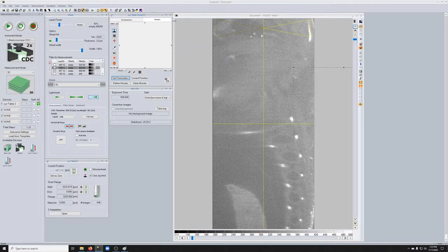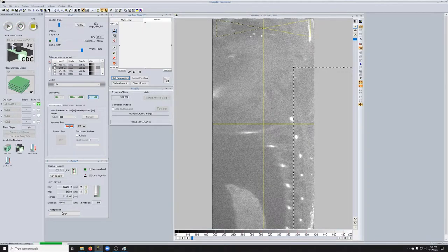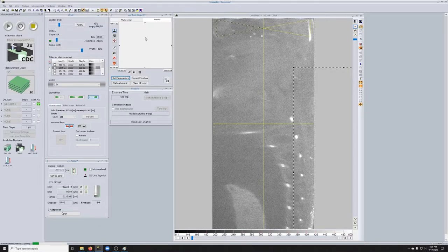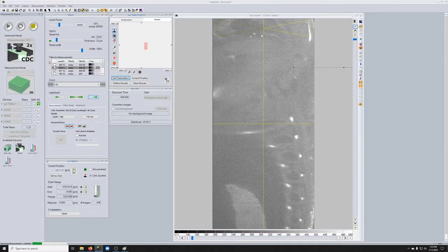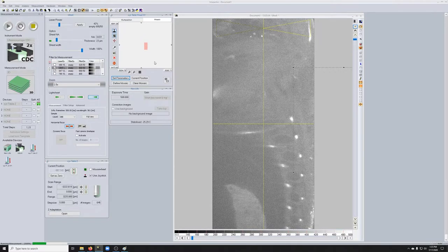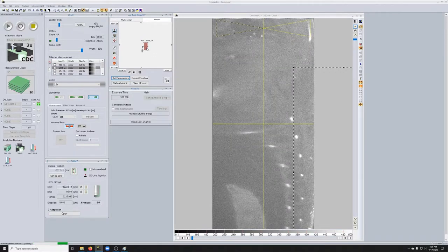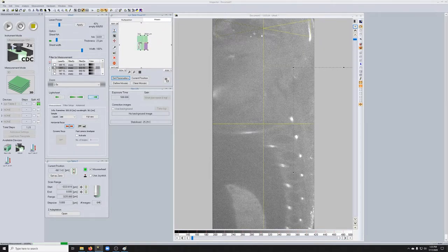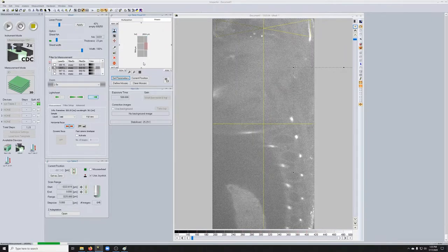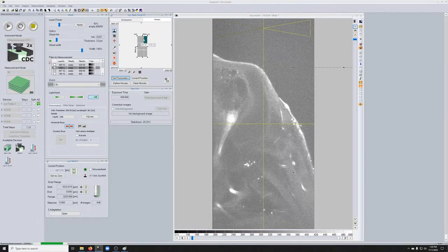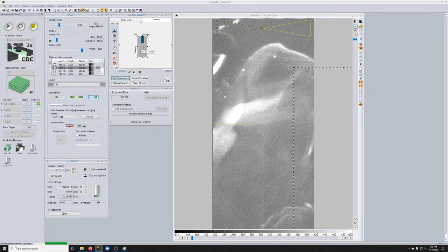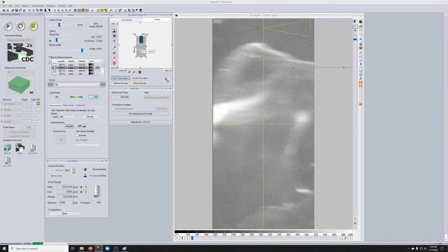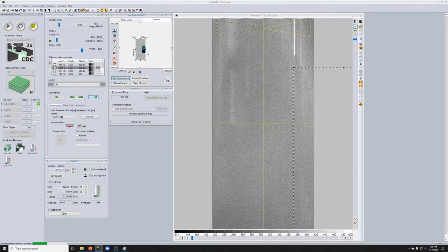So the next issue is to go live. And now what we're going to do is mark the edges of what we want to image and slowly build up the tile. So if we click on this button here, we've zoomed to the range of positions. This represents where we are right now. If I double click on it, you'll see I have some handles. If I move the handles, I can create new regions that I want to image. And by double clicking on various positions, I can send the stage to those positions. I can move the stage, either by moving it with the joystick, which I will do now so you can see, or double clicking.